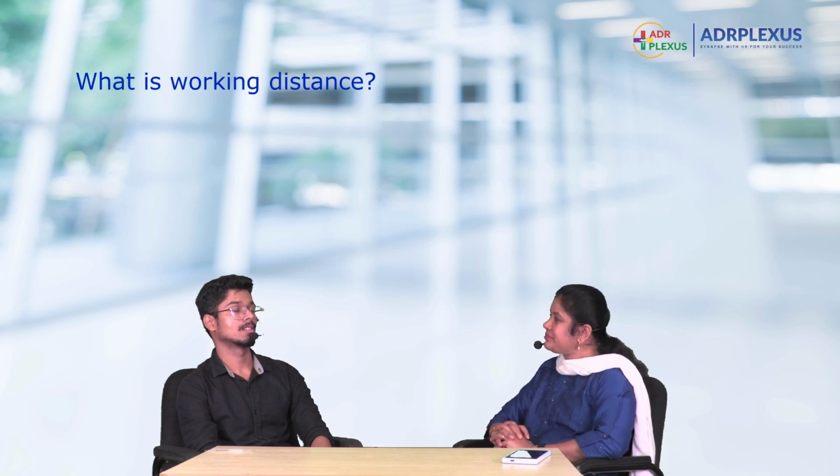What is working distance? Working distance is the distance between the objective lens and the object, ma'am. For the low power, we have 5 to 15 mm, for the high power, 0.5 to 4 mm, and for the oil immersion, it is 0.15 to 1.5 mm, ma'am.